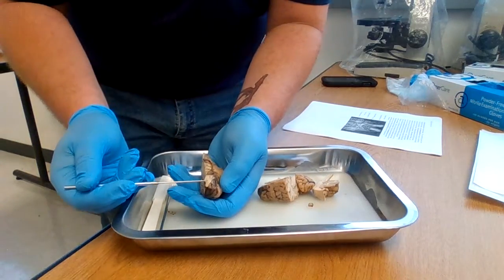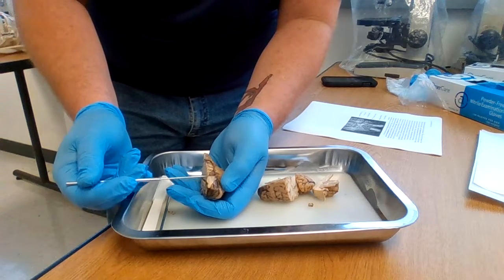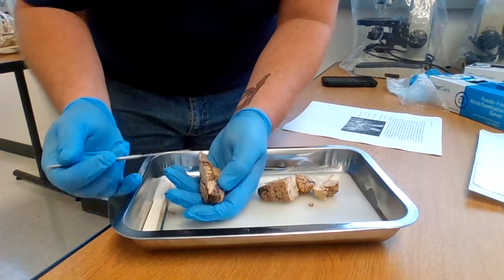Flip the brain around, we're going to have the olfactory lobes. Right in between the two olfactory lobes, there's going to be a longitudinal fissure.